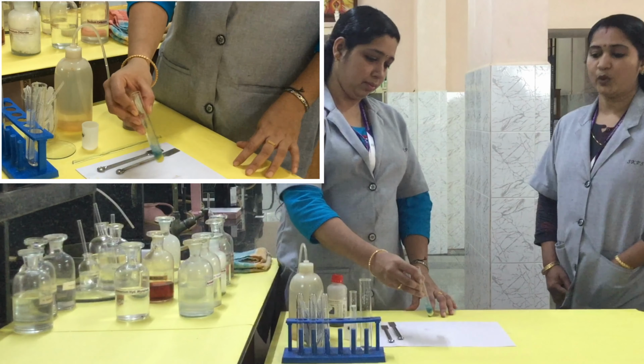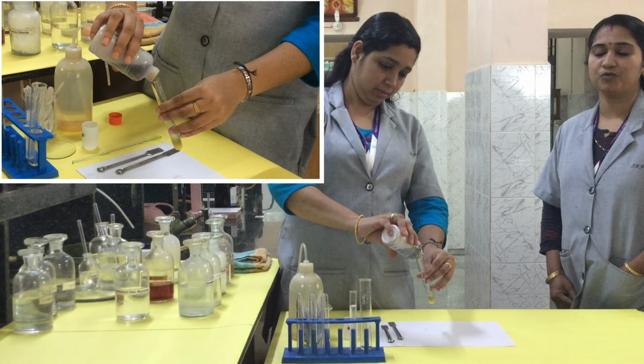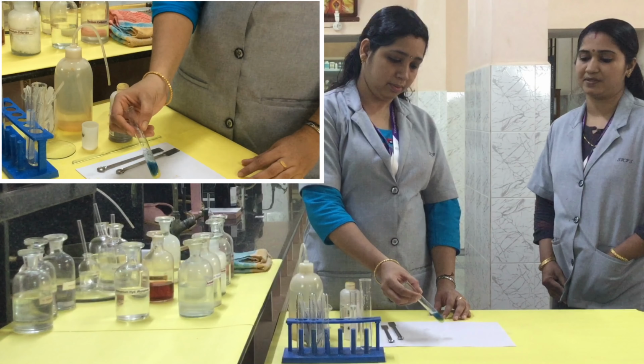Now we got a blue color. This blue color confirms the presence of magnesium. When you use Magneson reagent, you will get a blue color if magnesium is present. So we confirm the presence of magnesium using Magneson reagent. Blue color is obtained.